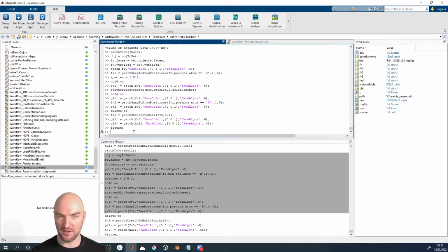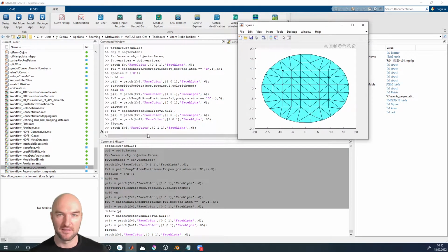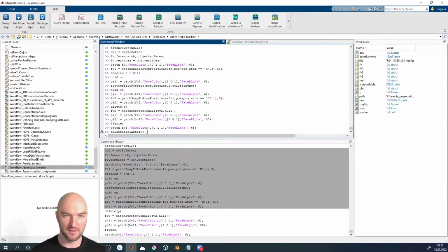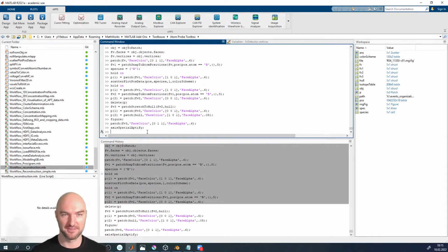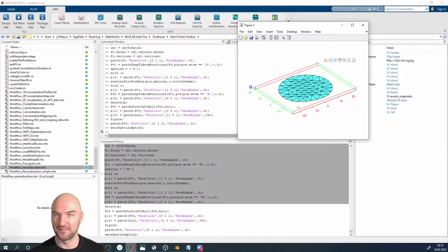Okay, so what did I want to do? I patch, create the patch. The last one that we have was called FV3. And let's make the axis equal. Oh, we could APT-fy the axis now, but it doesn't matter right now. Why not? Why not APT-fy the axis?